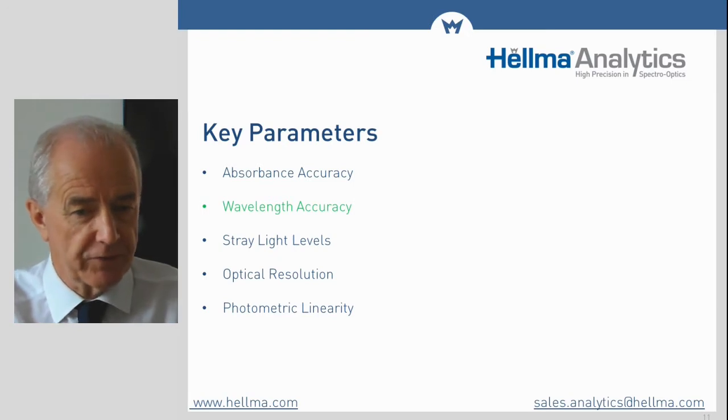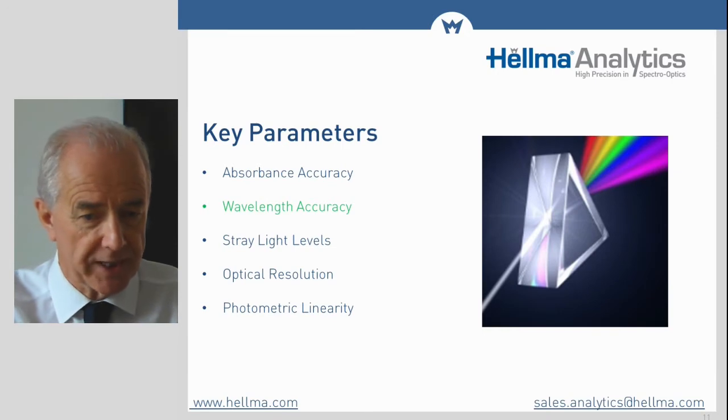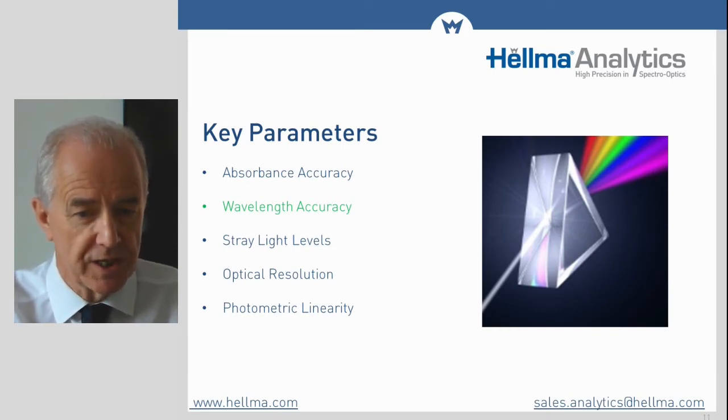Most UV-Vis spectrophotometers work over a wavelength range from 190 up to 800 or 1100 nanometers. Traditional monochromator instruments may have dual or single light sources and will have some critical wavelengths where lamps are switched over or blocking filters moved into the light path. You may hear this happening during a wavelength scan.